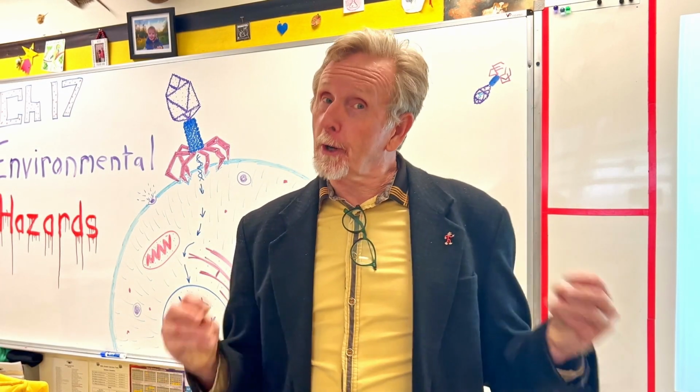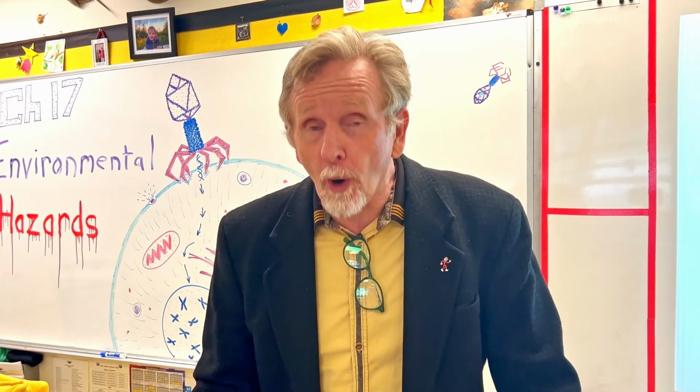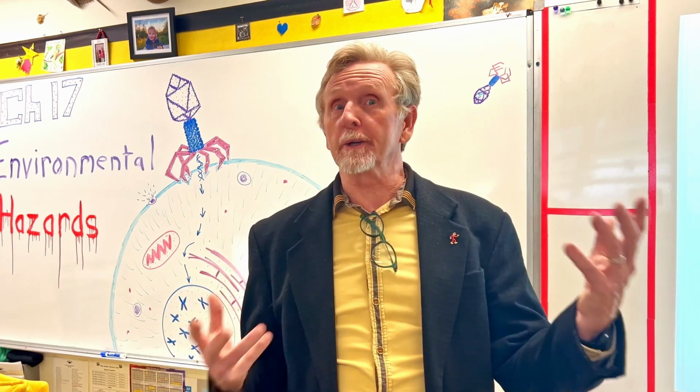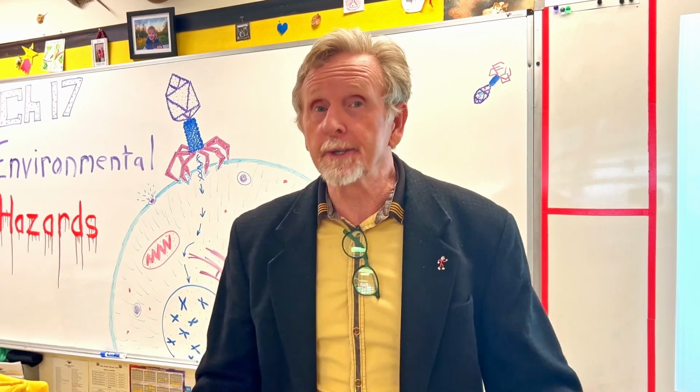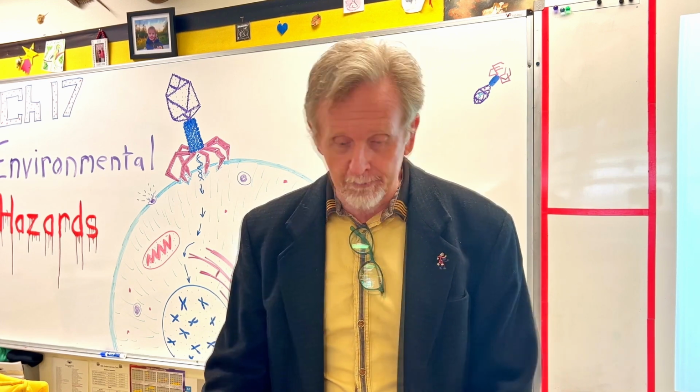Today we're going to do some water tests. Now there's an awful lot of tests you can do to water to find out if it's healthy or not, or whether we expect to have pathogens in it, a whole host of things. We're going to do three fairly basic ones.